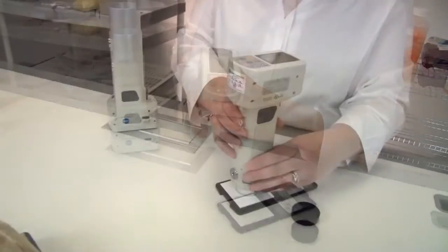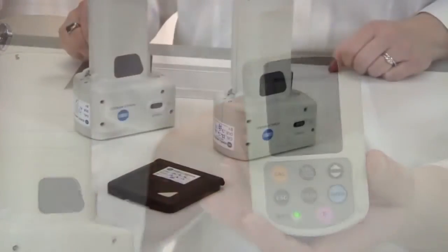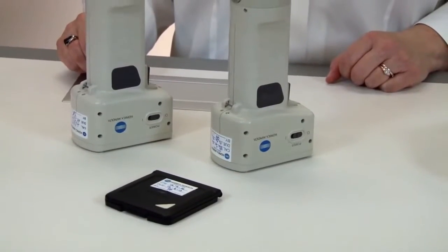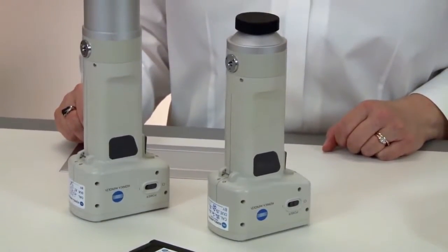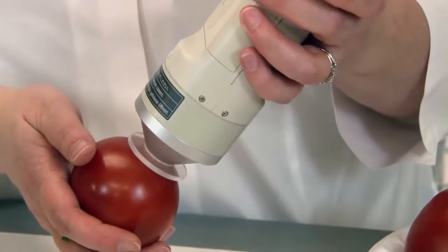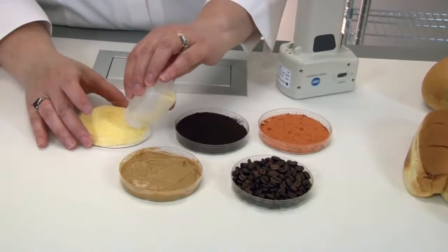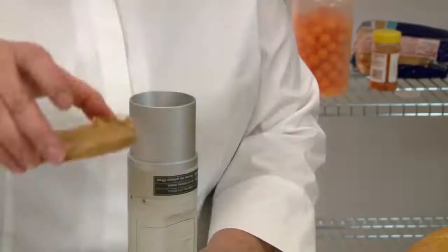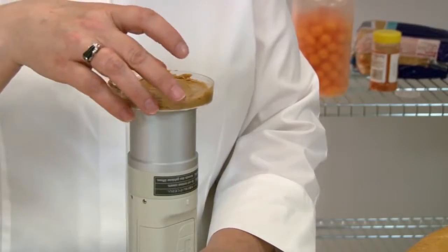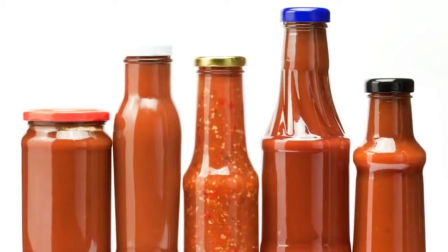The CR400 series features a user index function allowing customers to custom configure the instrument to create an index. This feature is extremely useful when customized evaluation formulas are preferred over standard color difference equations. You can create an index specific to your product or purchase a product-specific index such as peanut butter, french fry, coffee, or tomato from Konica Minolta.